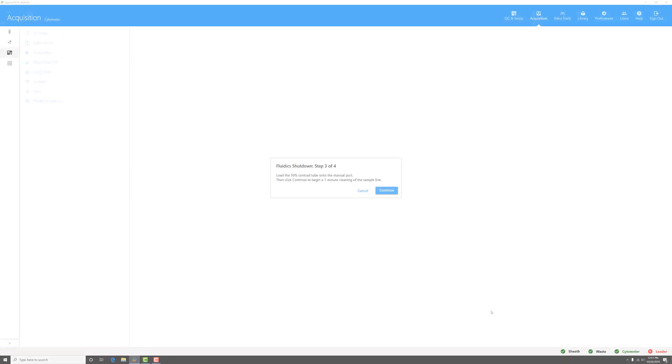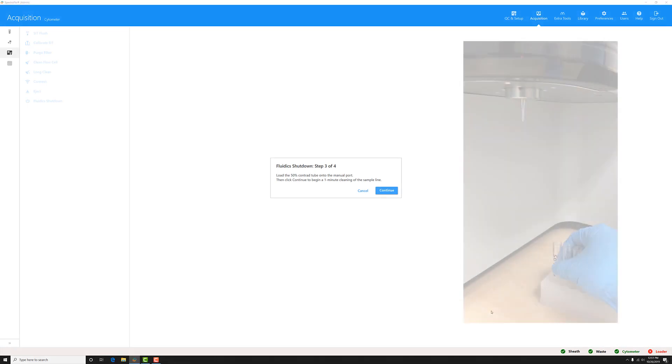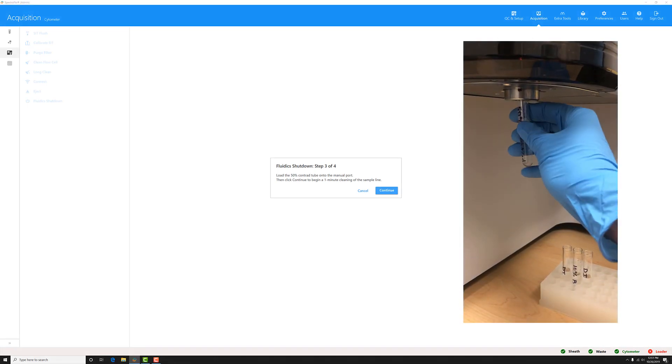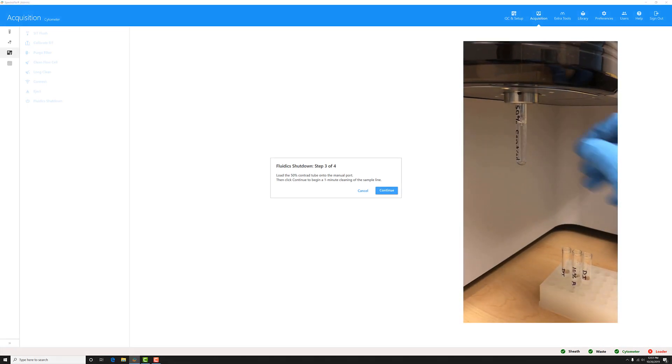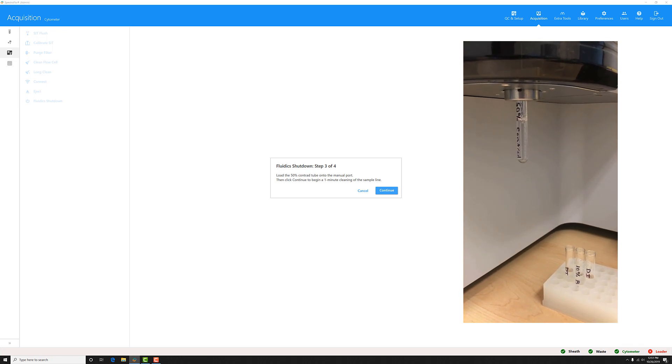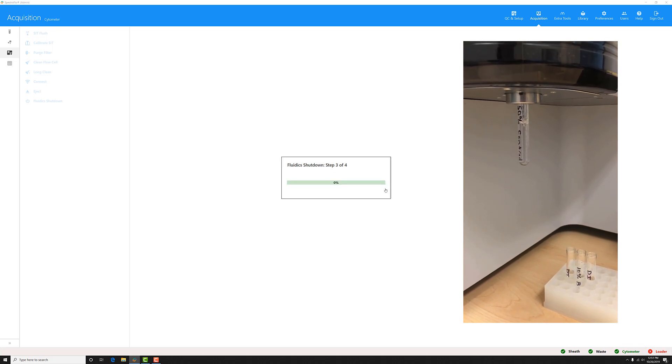Now I'm going to unload the second tube and load my third tube, which contains a 50% Contrad 70 dilution, and click continue.